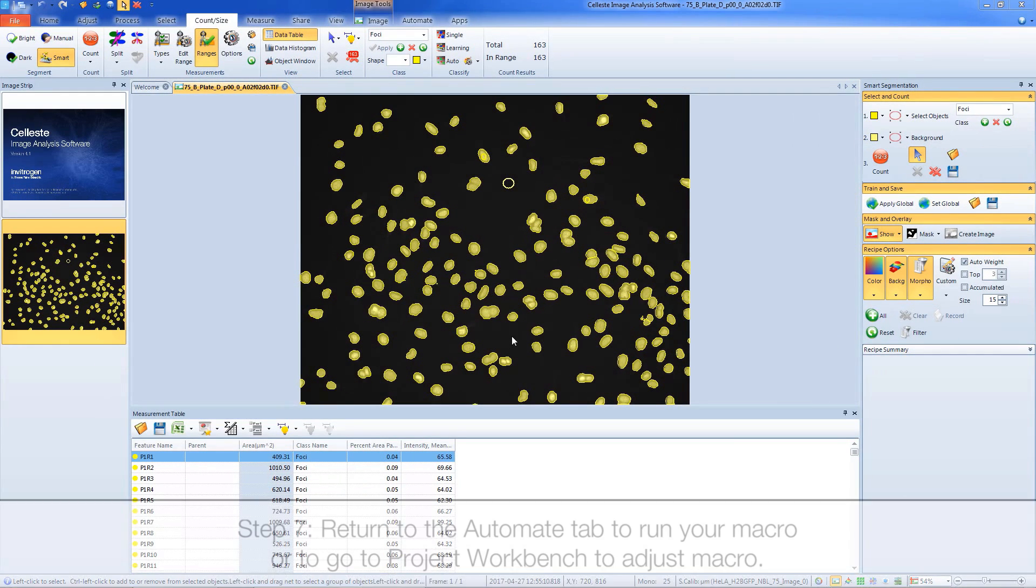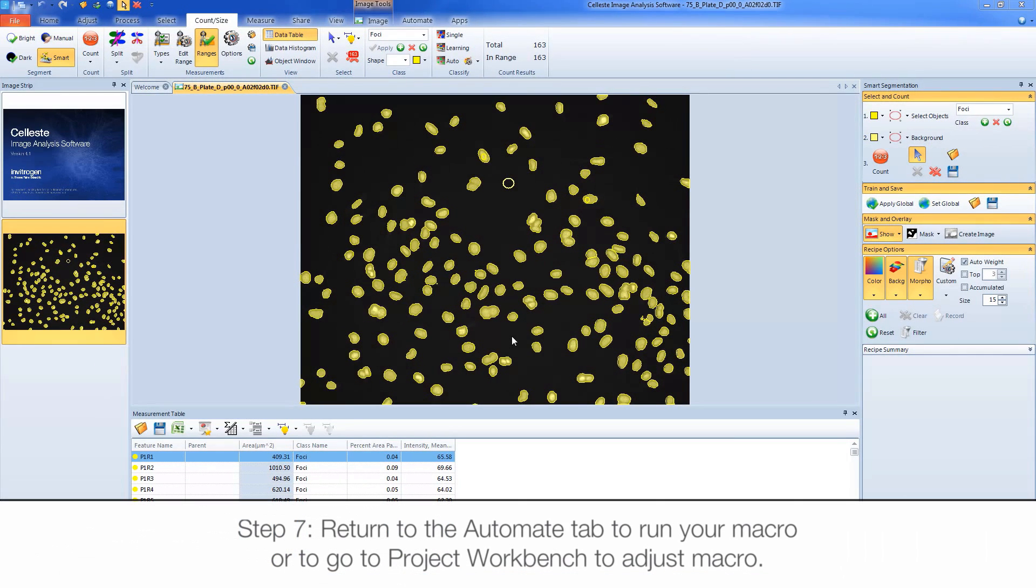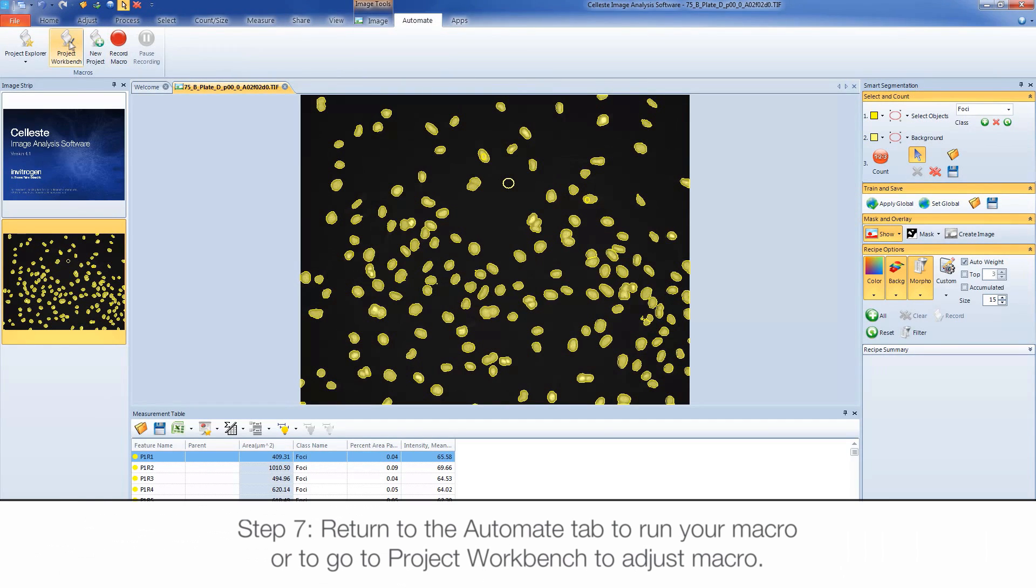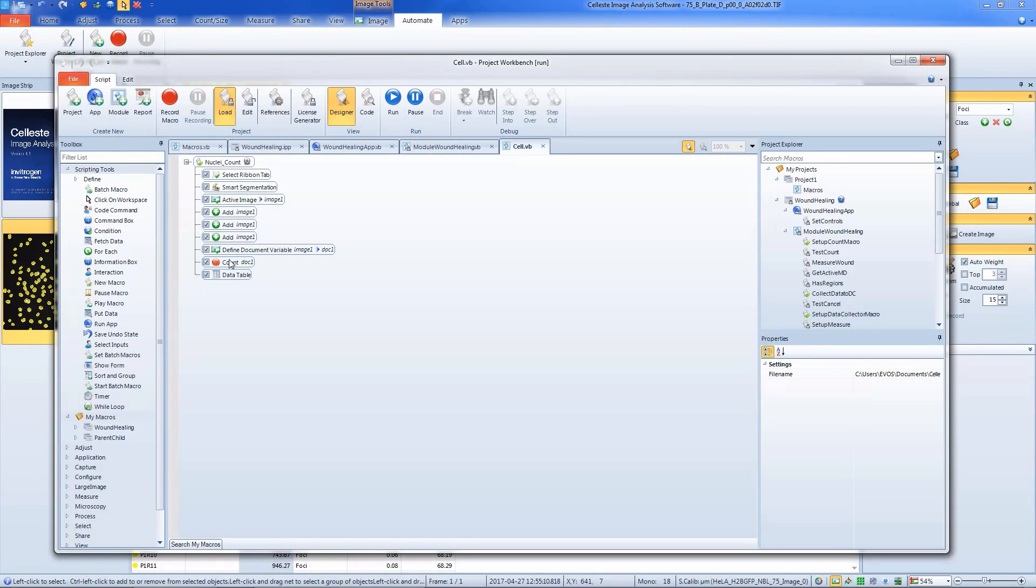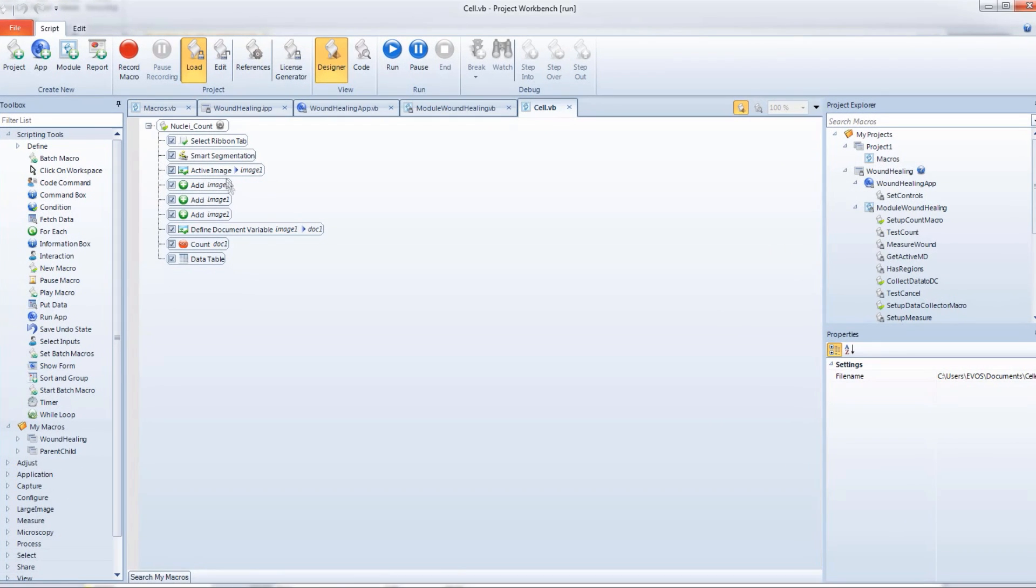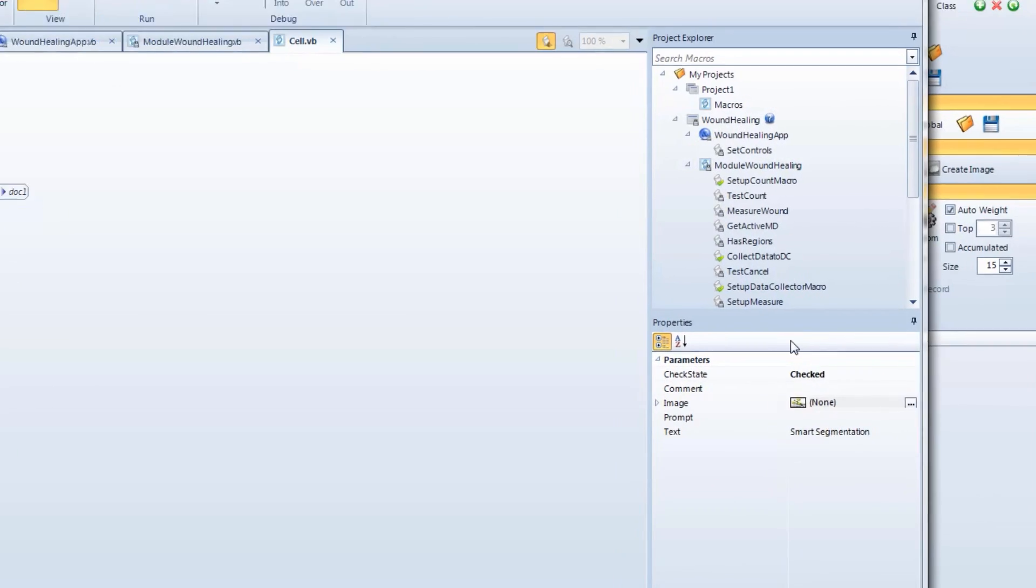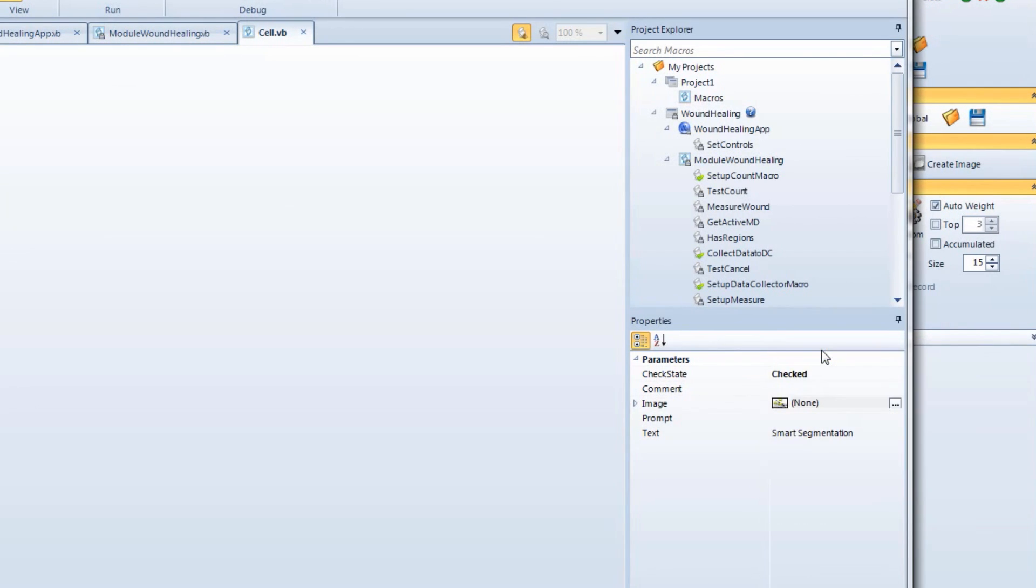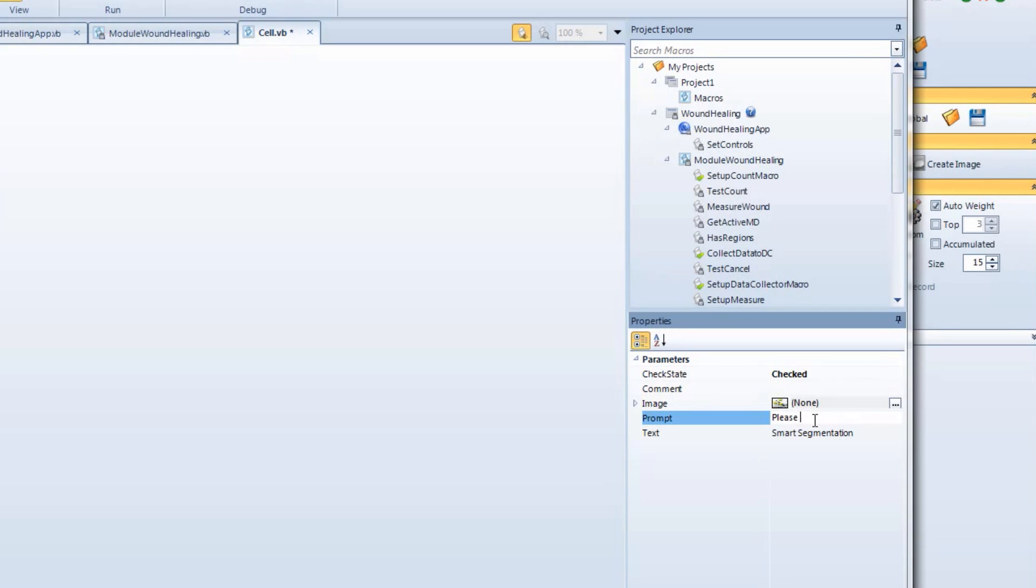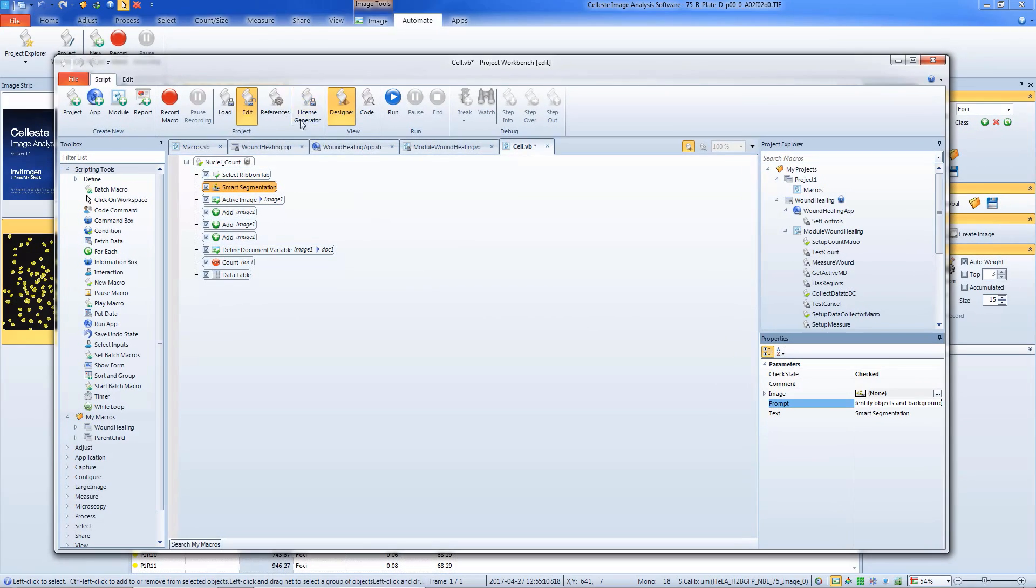View the recorded macro by clicking on the Project Workbench button in Automate. If you'd like to add an interactive step where the user is prompted to perform an action, select the step you want to make interactive and right-click on the Properties box to select Prompt User in the Imaging Workspace. A prompt can then be written in the Prompt field below. Click the Load button to save any changes to your macro.